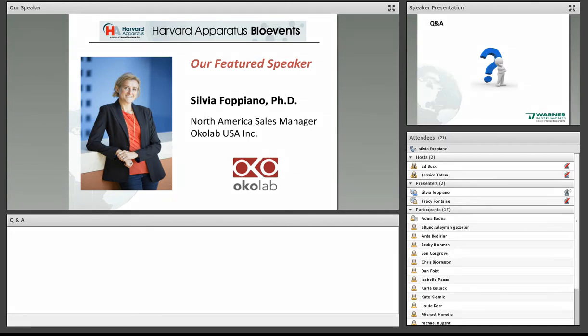It will take them a very long time to become confluent, but you will still have to replenish the media periodically. We've had a French researcher doing an experiment that was 10 days long. We had another researcher sending us a video that was taken from a Friday to a Tuesday. So it really depends on the sample mostly.